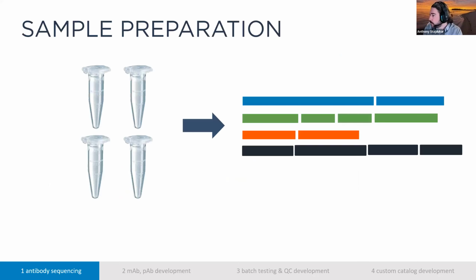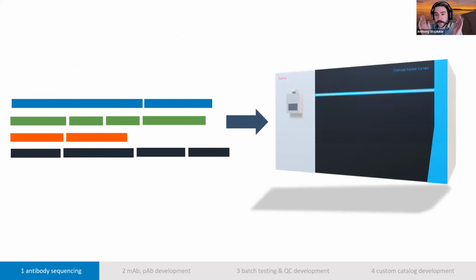So a little bit more detail, so it's not so fast. Sample preparation, as I said, we started with different enzymes, and you'll be seeing some data in a moment as well. The different colors here actually denote different sample enzyme chemistries. So we have a handful of different enzymes that we use, but each color in our data is specific to the enzyme that was used. The reason is because they can cleave at different sites depending on the enzyme of interest.